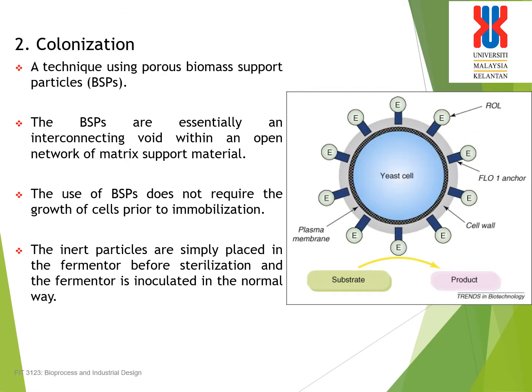The second one is colonization. For this technique, the cell becomes attached to a matrix support material. It will colonize on this support material. The membrane here is actually a porous structure, so the cells will attach to each other and to the surface of the support.